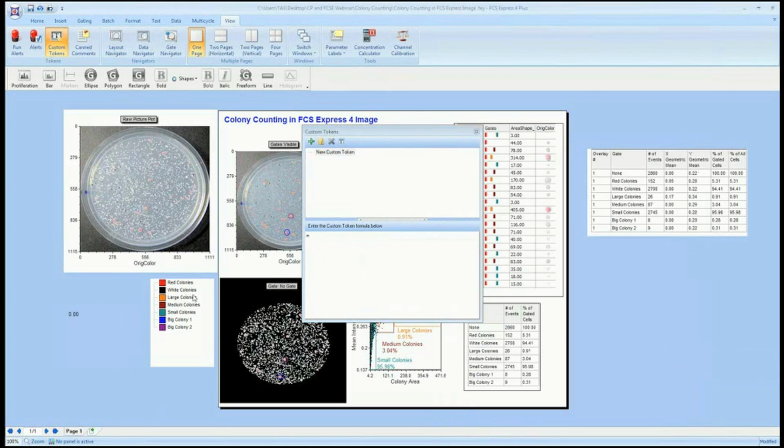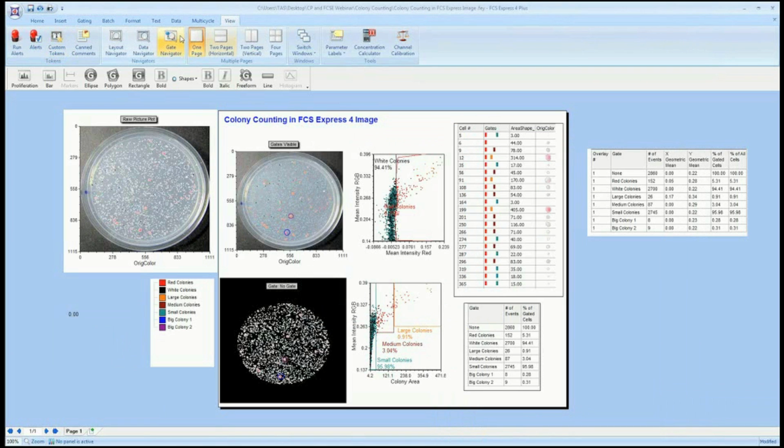We can also insert bar plots and scatter plots. You saw the scatter plots in the regression analysis, but we can do the same thing with bar plots as well.